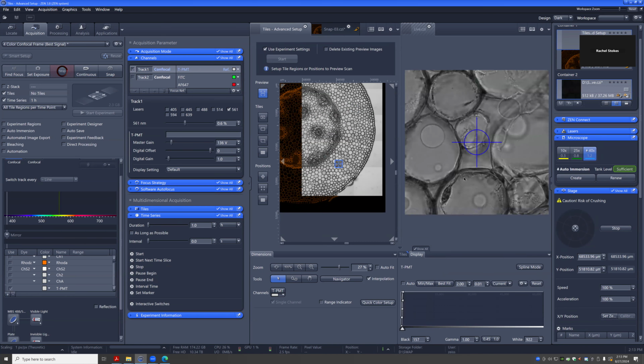Okay, that's good. So the engineer set a pretty good parfocality because we switch between objectives. It looks like we still have pretty good focus. If it was very blurry between switching the two objectives, it's adjustable to set the height of the objective when it switches between. You always want it to be within about a quarter or so of the focus turning the focus knob.